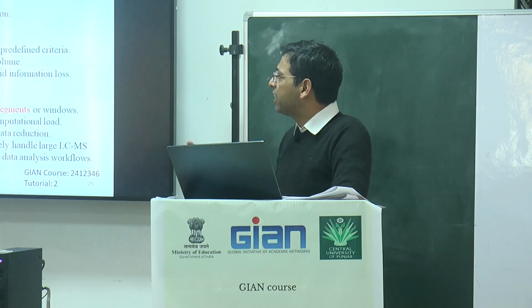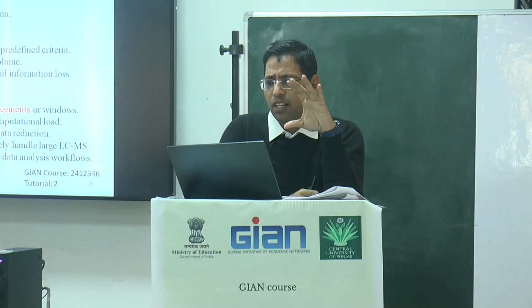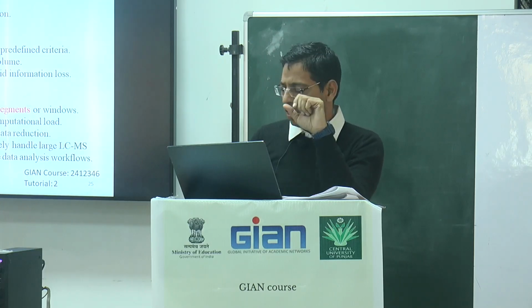So data processing techniques के लिए we are using the different concepts. These are the three different concepts for the data processing. The first is the binning, second is the search of the region of interest, and the third is the time windowing.